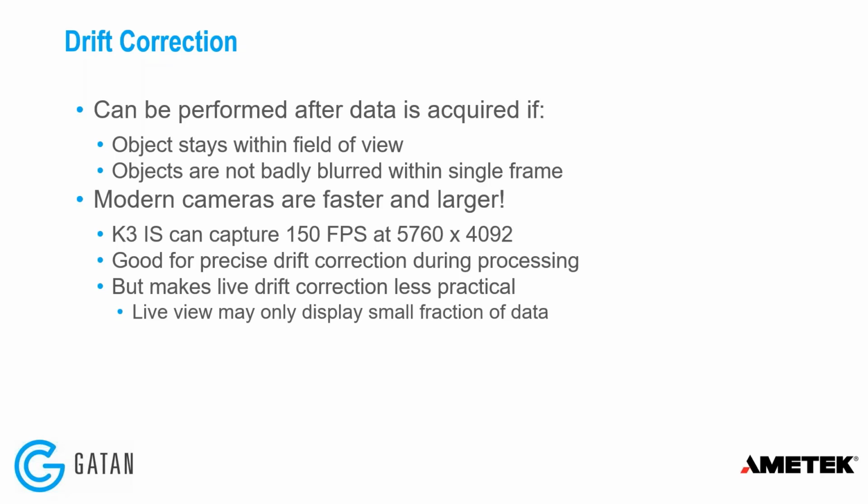And so you simply can't show that. And also the frame rate as well, 150 frames per second. No monitor, I don't think, exists, certainly not a typical monitor, could even display 150 frames per second.